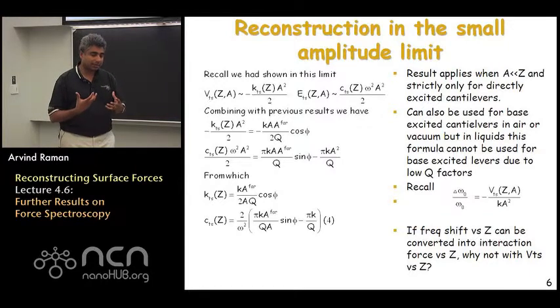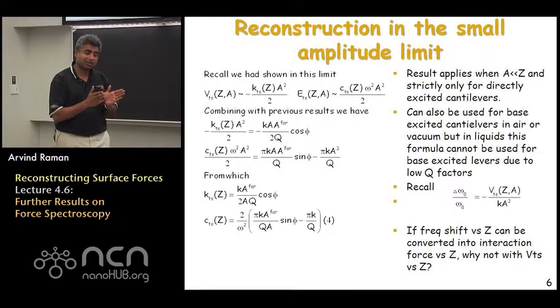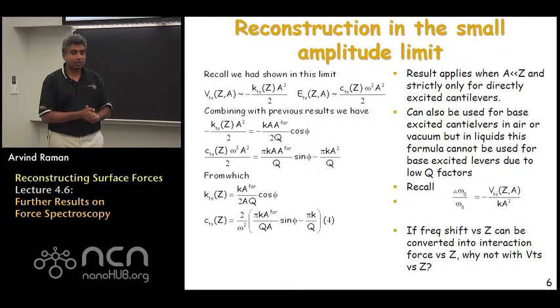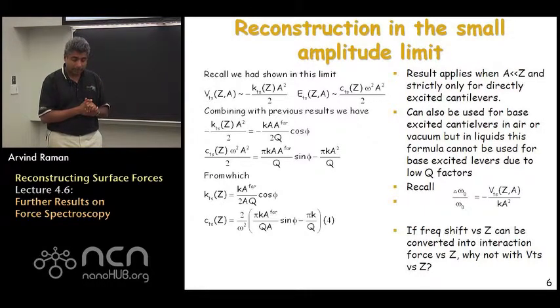So this approximation tends to be valid in the case of long-range attractive force gradients, or very long-range repulsive interaction gradients, when one deals with extremely soft materials where the Young's modulus might be less than 10 megapascal or less than a megapascal or so. In those cases, this assumption might actually be reasonable and valid.